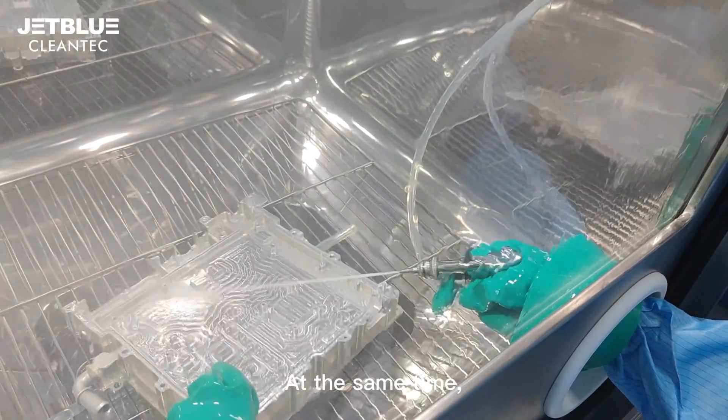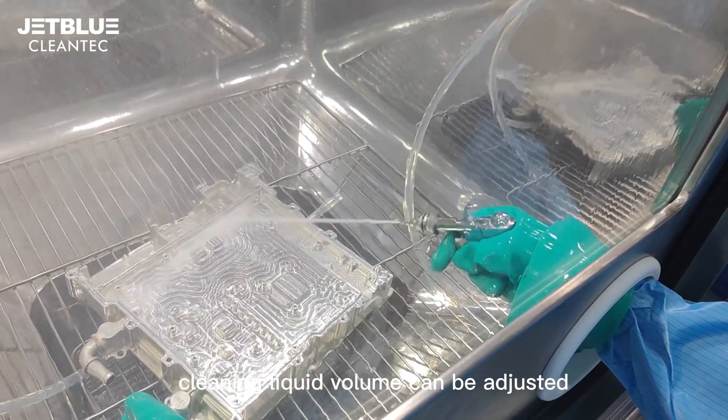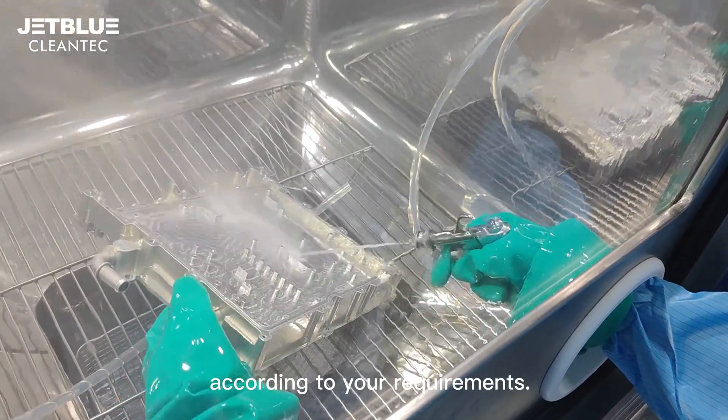At the same time, cleaning pressure, cleaning time, and cleaning liquid volume can be adjusted according to your requirements.